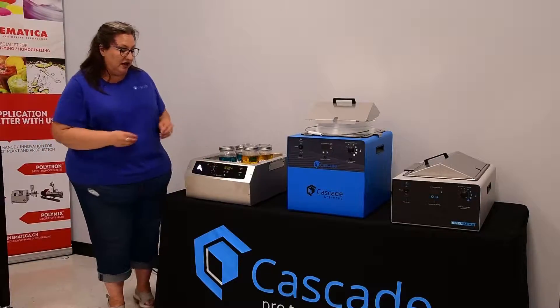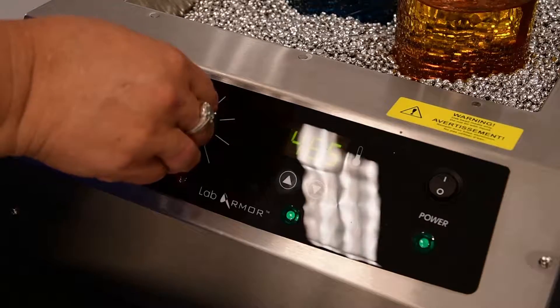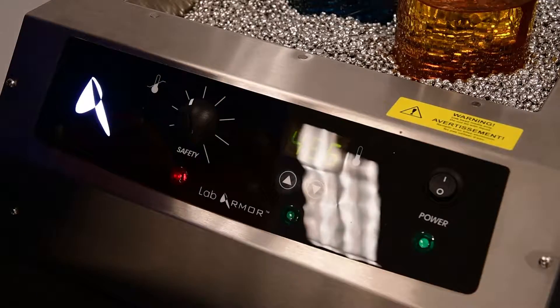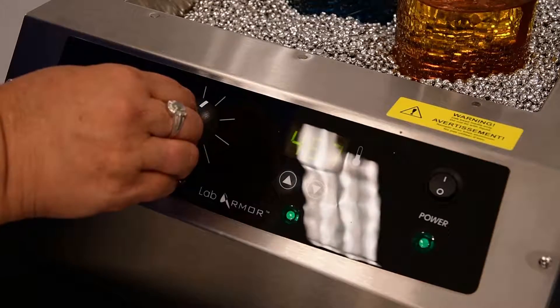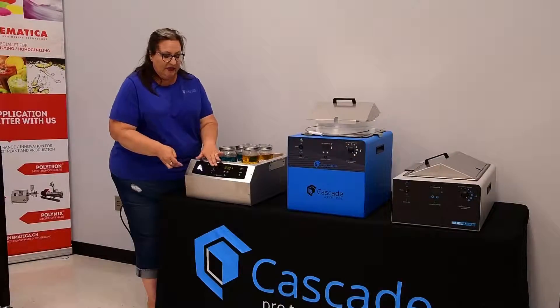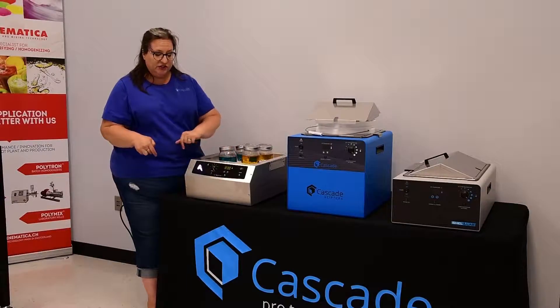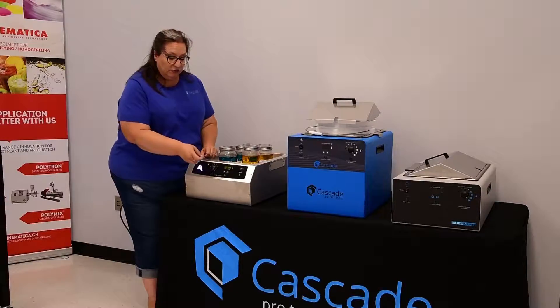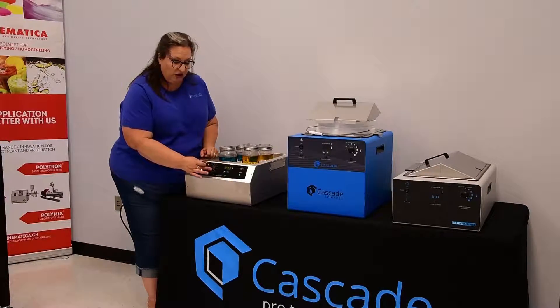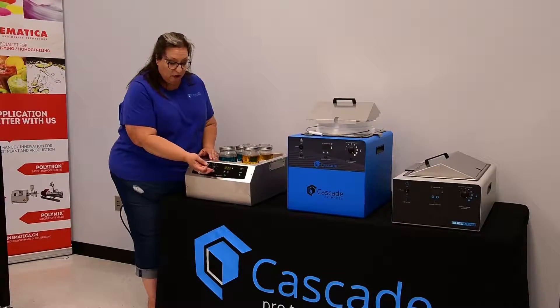This little knob right here is called a mushroom knob. It's an internationally recognized safety knob because you can't really twist it yourself — you can't walk by it and brush it, it can't be easily adjusted. That's by design. This is the over-temperature protection; it has its own probe and thermocouple. Should there ever be a situation where this controller, for whatever reason, runs away or the elements short to ground and take off, this will act as a fail-safe controller, stop the heating, and hold at the original temperature set point. The way you set it is with a coin or a broad screwdriver. It comes from the factory all the way open — that's the highest setting, which means it's all the way out of the way and likely not providing much safety at that wide-open mark.